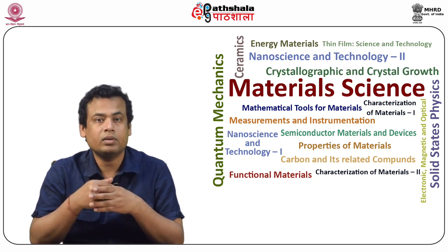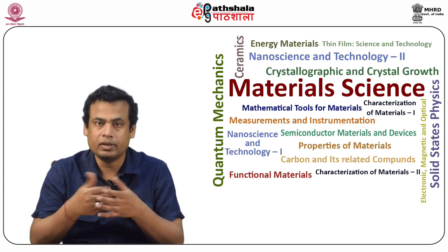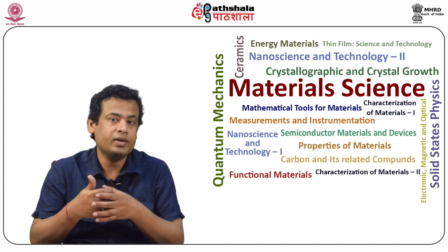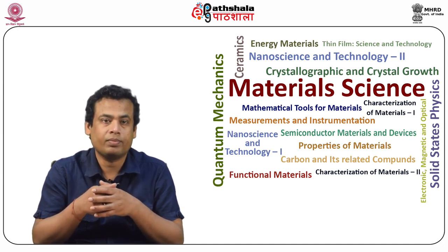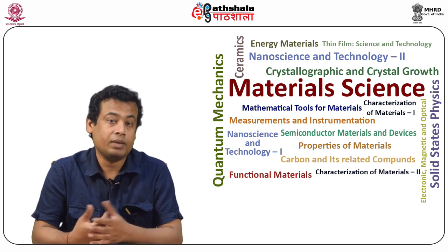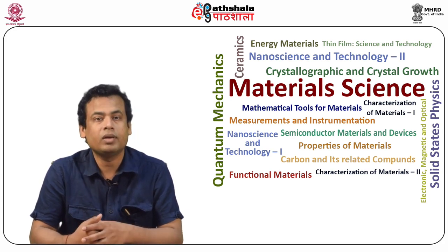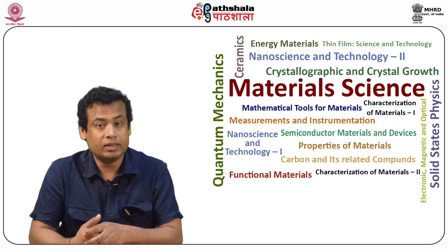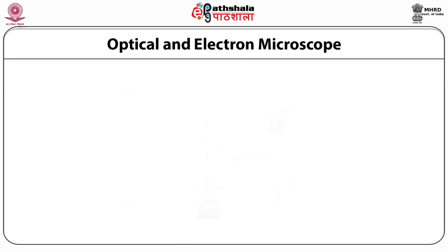An electron entering a material interacts as a negatively charged particle with the electric field near the nucleus of the atoms in the specimen. These interactions can be classified into elastic or inelastic interactions and are discussed briefly in the following sections.